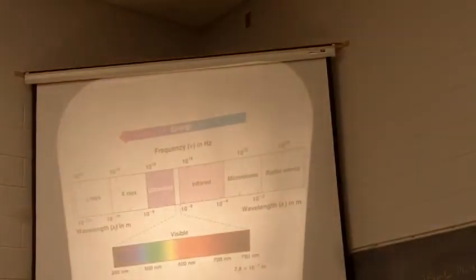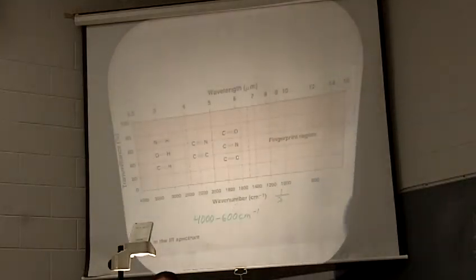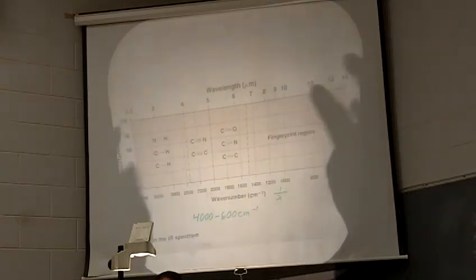Okay, so we've got our lower energy part of the spectrum, so we're not doing things like electron excitation. Things like that happen in the UV. We're talking the lower end, okay? So here's general information for a spectrum that we are looking at, okay?